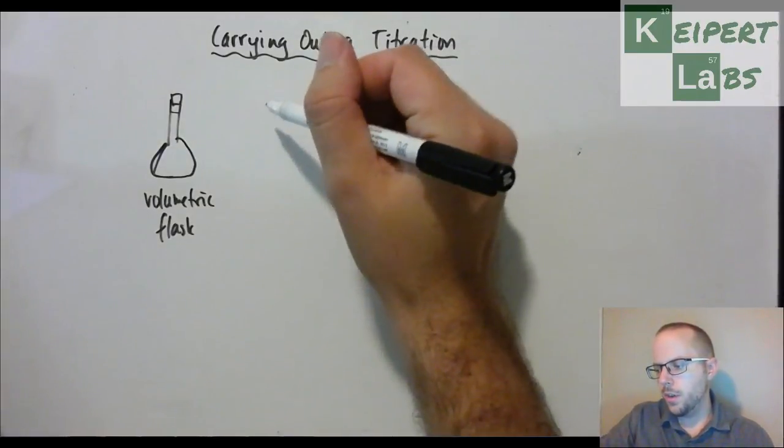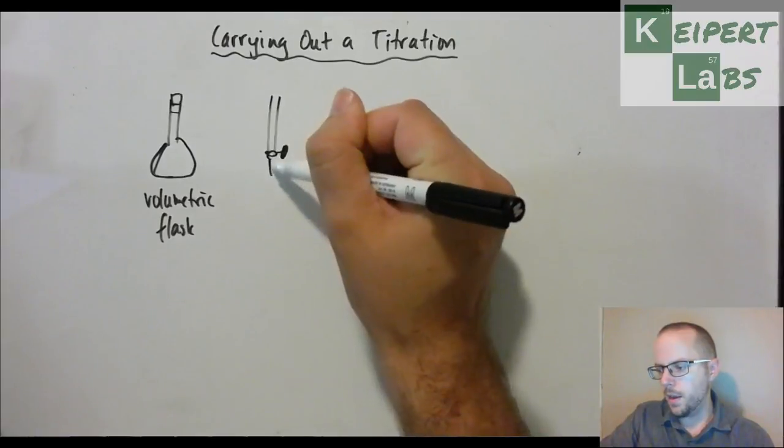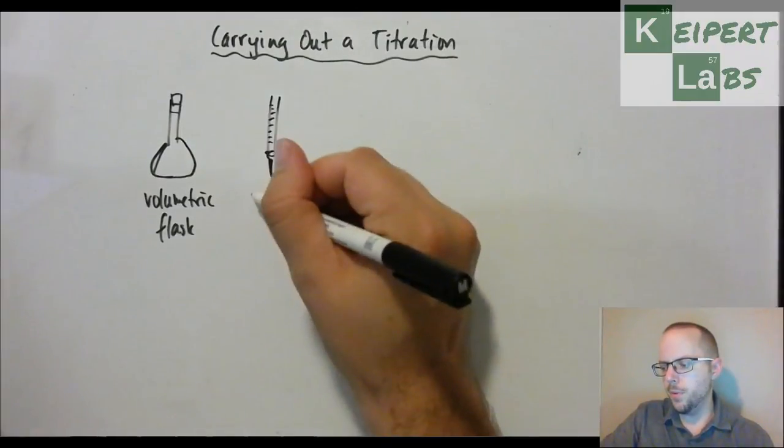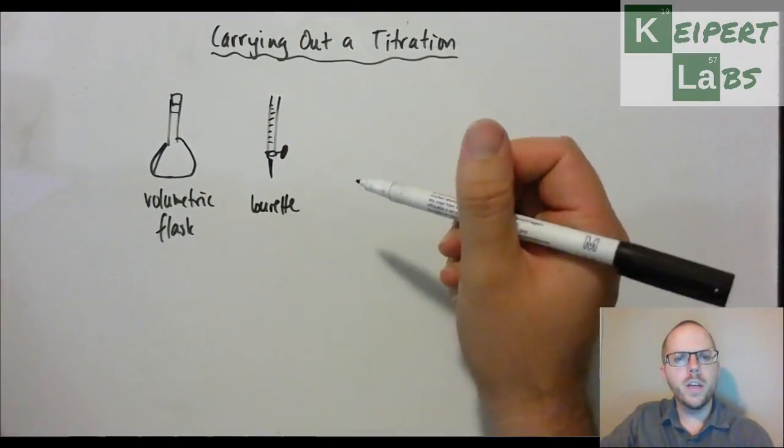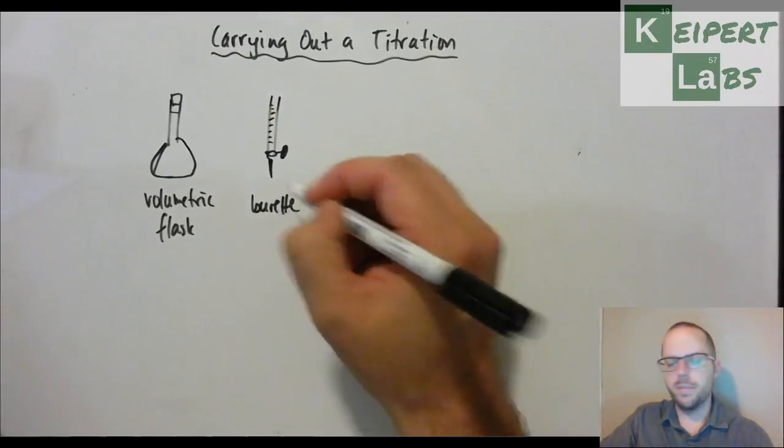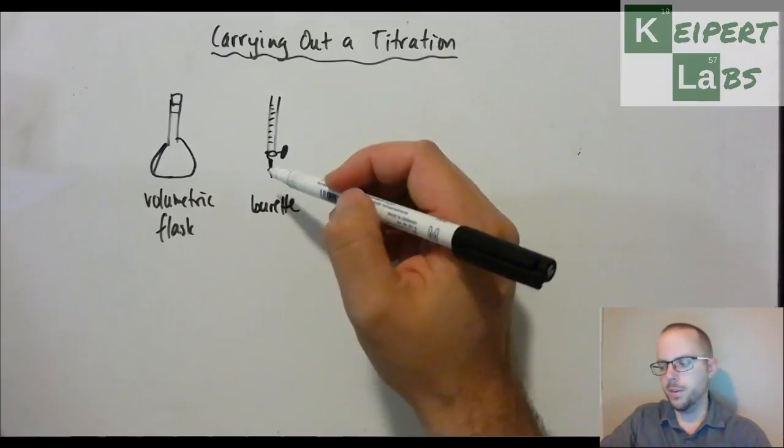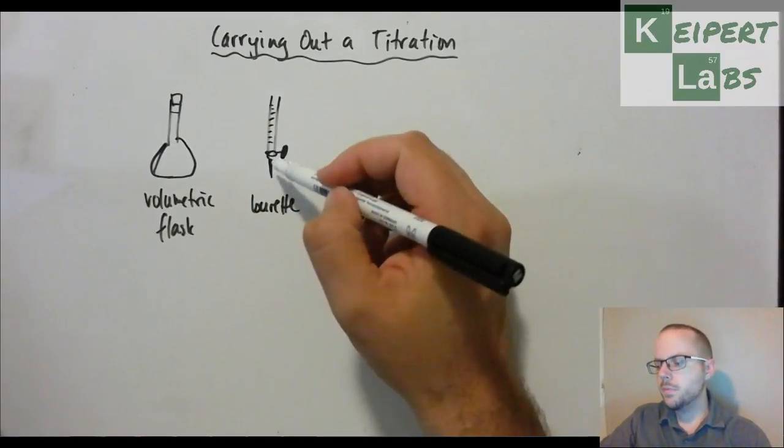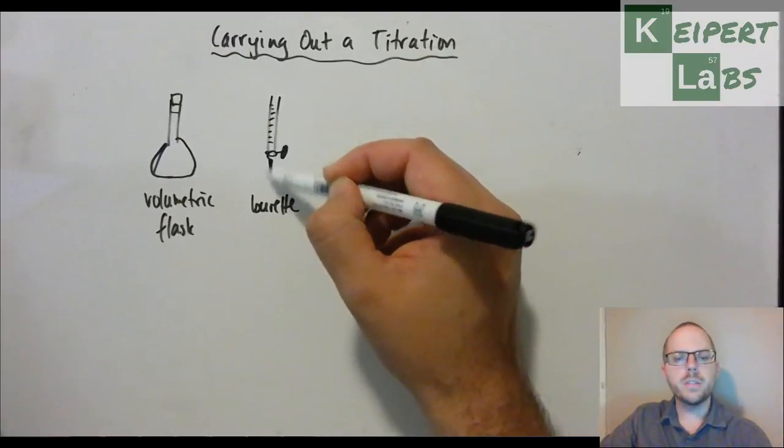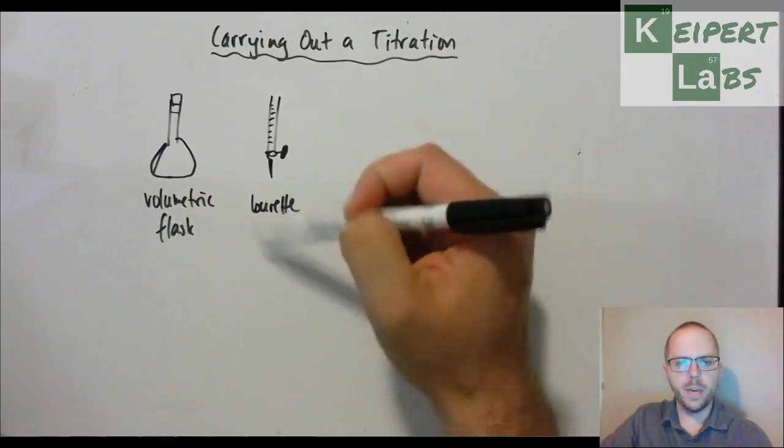Then we've got a piece of equipment that looks like this. It's got a little tap and then a little point that goes down here and some markings on the side. This is called a burette. We use a burette for delivering a known volume of solution through the tap into another flask. We typically would put a burette attached above a conical flask or a beaker if you're desperate, but conical flask is best. By opening and closing this tap, we can dispense a very specifically known volume of a reactant into a container with the other reactant.